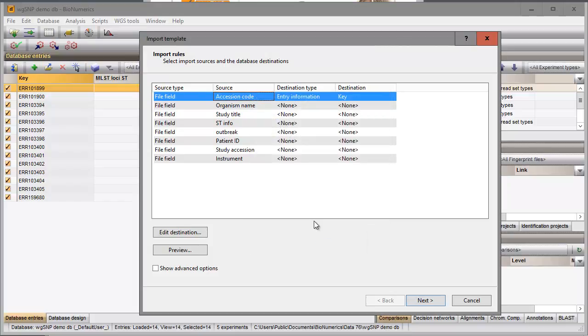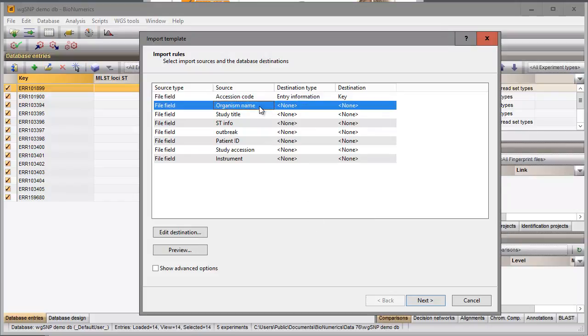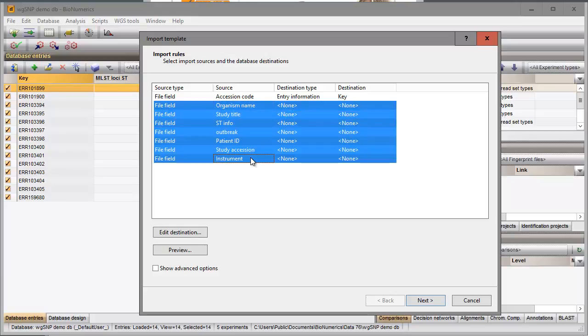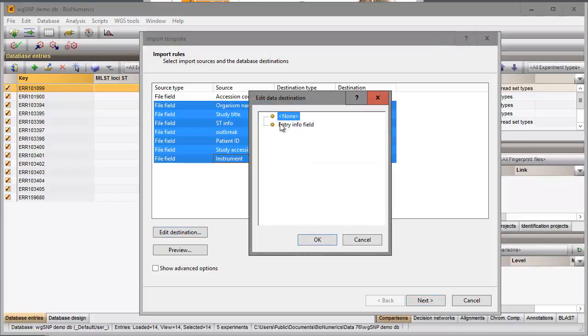All other columns in the Excel file can be linked to new entry fields in the database. I select all fields using the Shift key and select the Entry Info field option as destination.